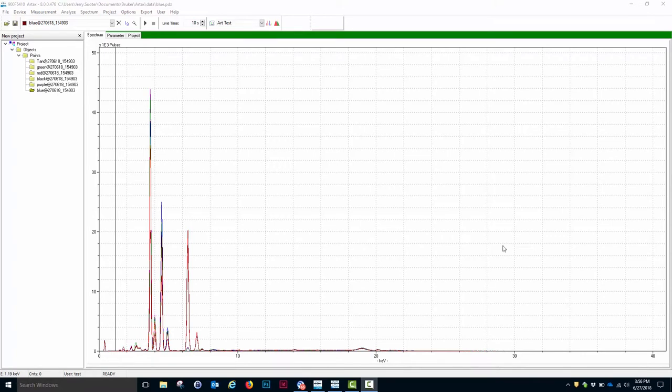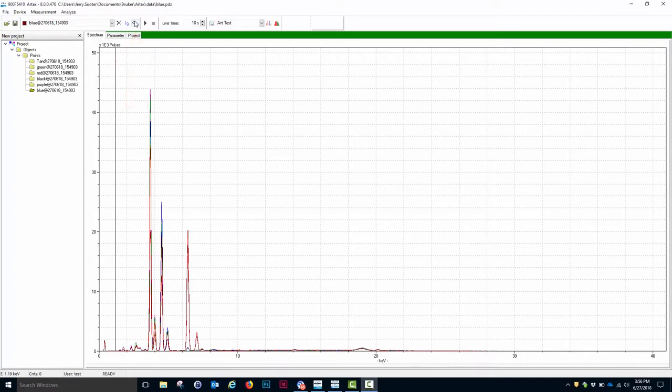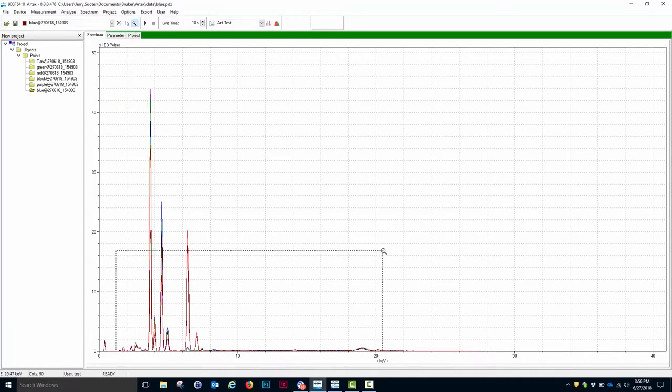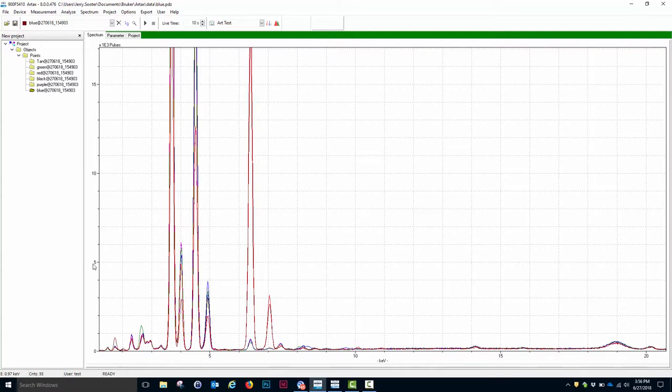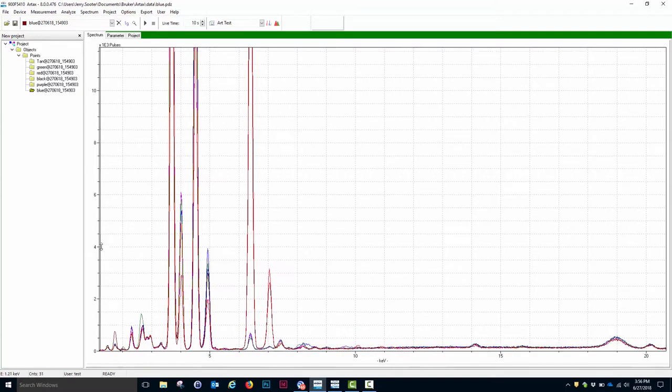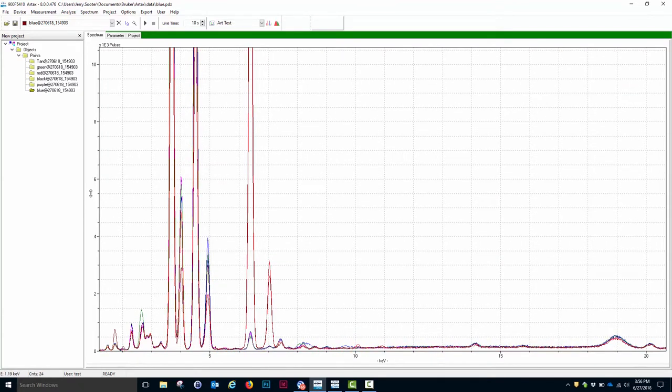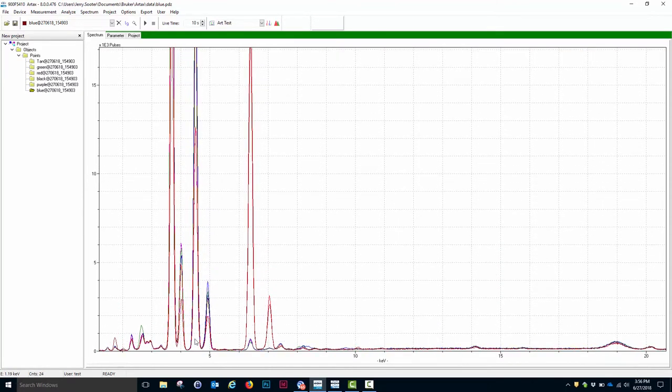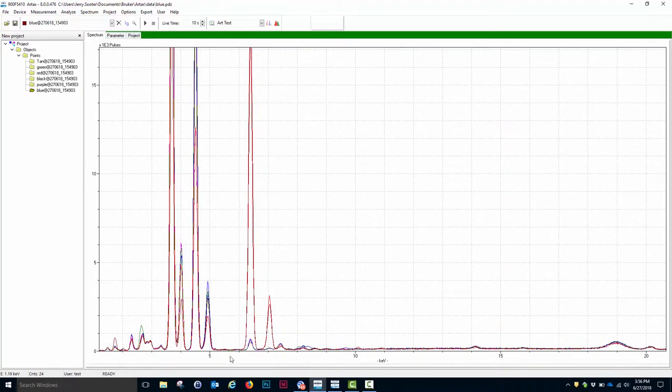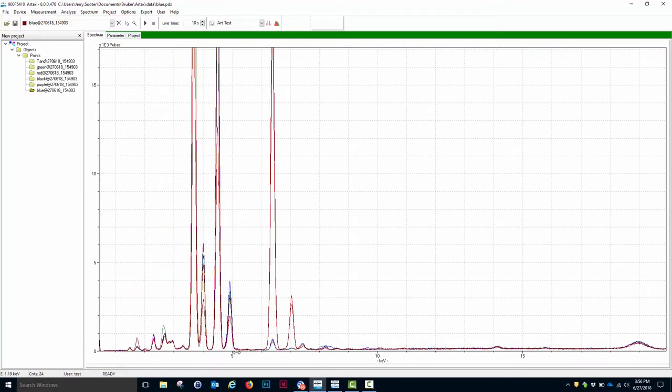There are several controls that give you better viewing capability of the data. The first is this magnifying glass icon, which allows me to expand any part of the spectra. Once I've done that, I can zoom the intensity axis by clicking on the intensity axis and scrolling up and down. I can scroll in the energy axis by clicking on the energy axis and moving right and left.